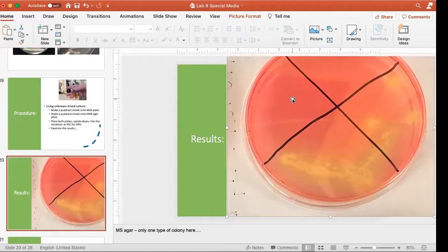That's important to know. And of course, the agar has changed color, hasn't it? The agar has turned a yellow color where the organism is growing. Now this is something you'll want to jot down because this is obviously part of the results and it's important to us. I put 2 organisms in that broth tube.